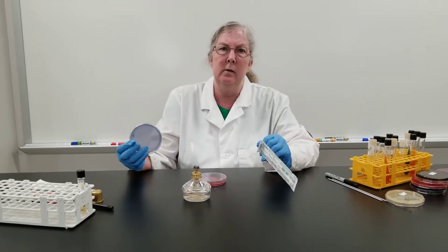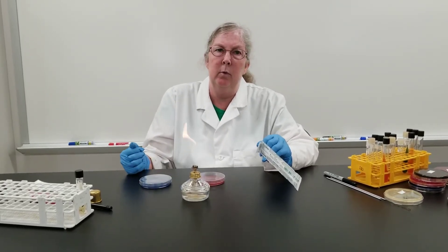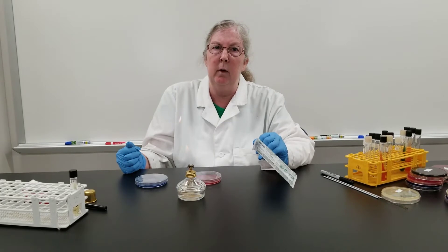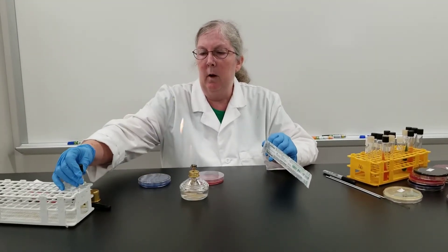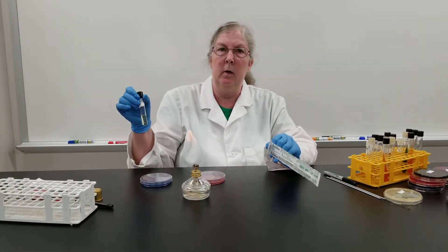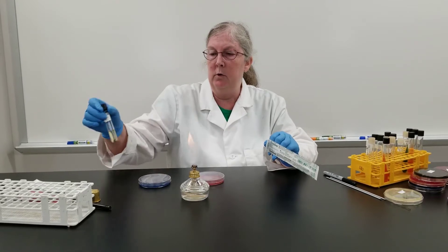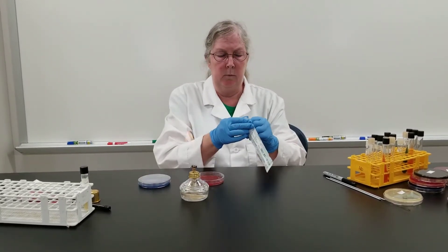This is a selective media for streptococcus. There is a dye in it that does inhibit both gram-negative and most gram-positive bacteria. And then we'll also, from the teeth swab and gum swab, inoculate a Todd-Hewitt broth, which is an enrichment medium also for streptococcus.